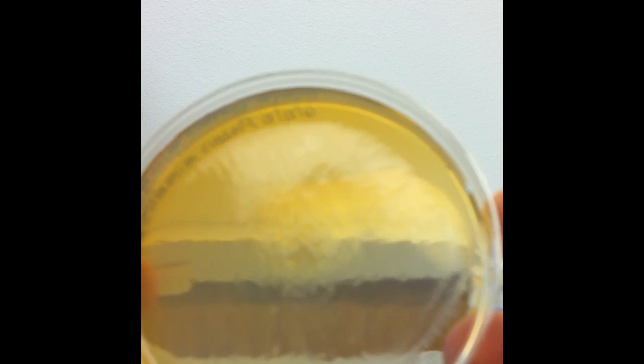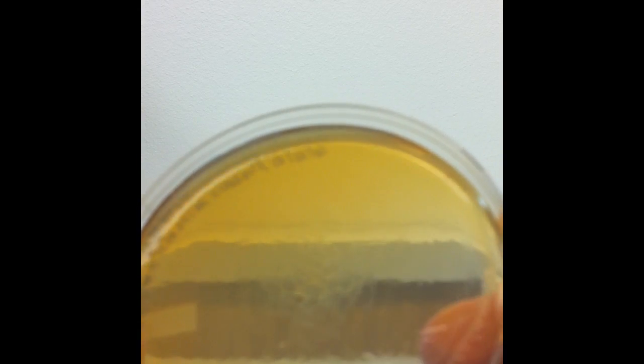Next we have two together, two that are related. These are both Proteus. I'm sorry, I misspoke at first, it's not Pseudomonas, it's Proteus. Proteus vulgaris and Proteus mirabilis. And the interesting thing about Proteus mirabilis is it spreads. There are bacteria all over this plate, and I don't know if you can see the source, but one single touch right in the center is all that was done to this plate, and it spread out and covered the entire plate. This one swarms like crazy.